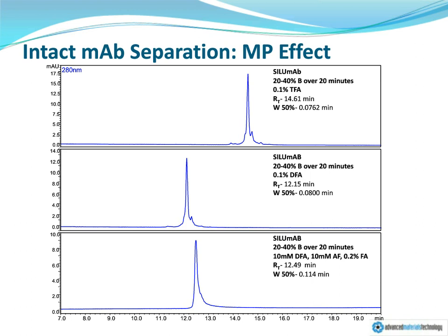And you can see that difluoroacetic acid by itself shows some advantages, we know, in terms of mass spectral detection capabilities, and similar characteristics to the excellent performance that we get with trifluoroacetic acid. As we've tried to modify that further, in this particular example, it has not been efficacious by adjusting the ionic strength of the ammonium formate.